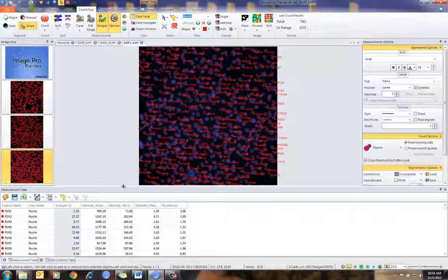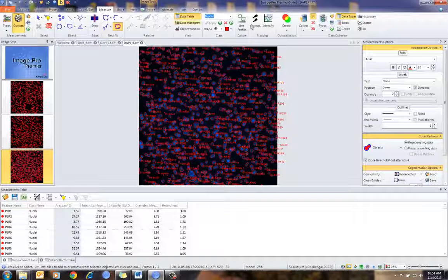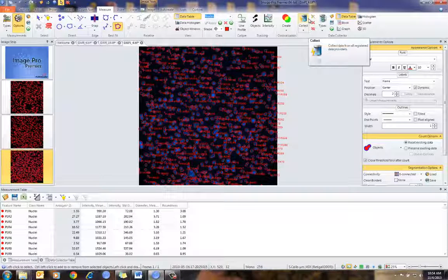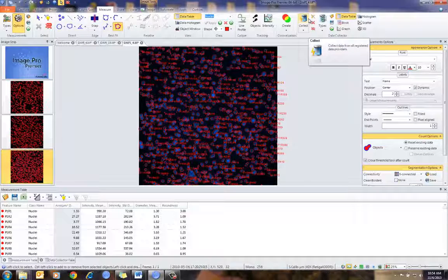One important thing is when I'm done counting the images, I'll typically want to turn off automatic collection — so if I'm doing something else, counting other images, or following some other protocol, I'm not accumulating data into this data table.